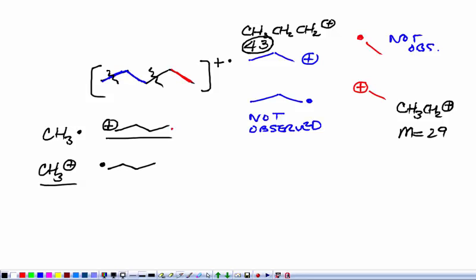So in this case, I would also potentially see a fragment at 15, and I would see a fragment here that has 4 carbons, 48, and then 48 plus 3, 51, 53, 55, 57. So I would also see a mass of 57 for the n-butyl carbocation.